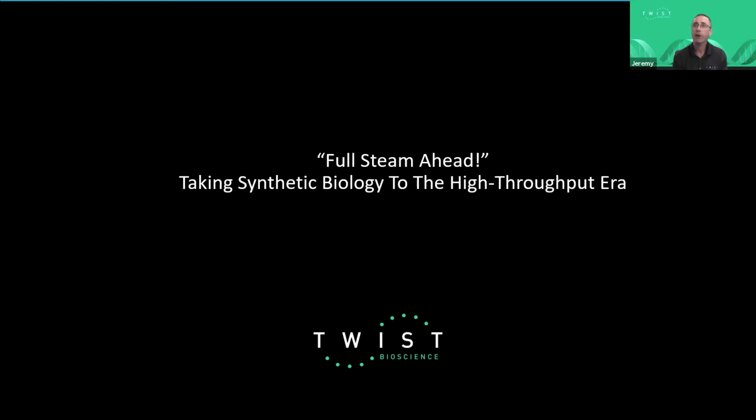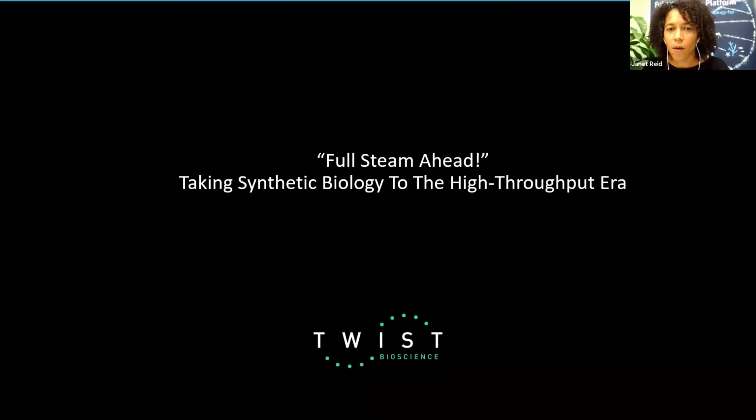Another anonymous, could I please ask the false positive rate for DNA assemblies? That really depends on the assembly methods. We found that there's variation depending on the strategies that people have employed. So yeah, that's really a strategy question.